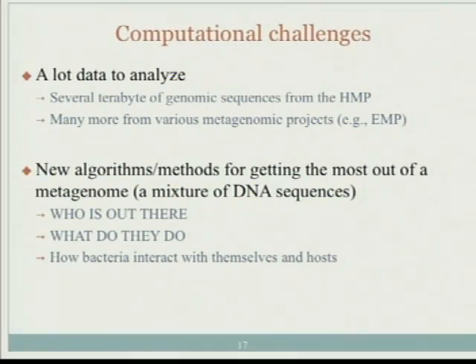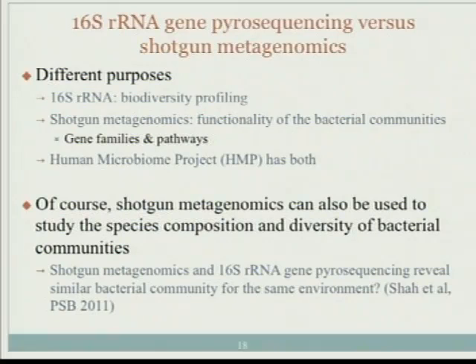You get so much data that it's difficult even to read in those huge files, not to mention analyze those reads. I will show some of those computational problems and challenges.